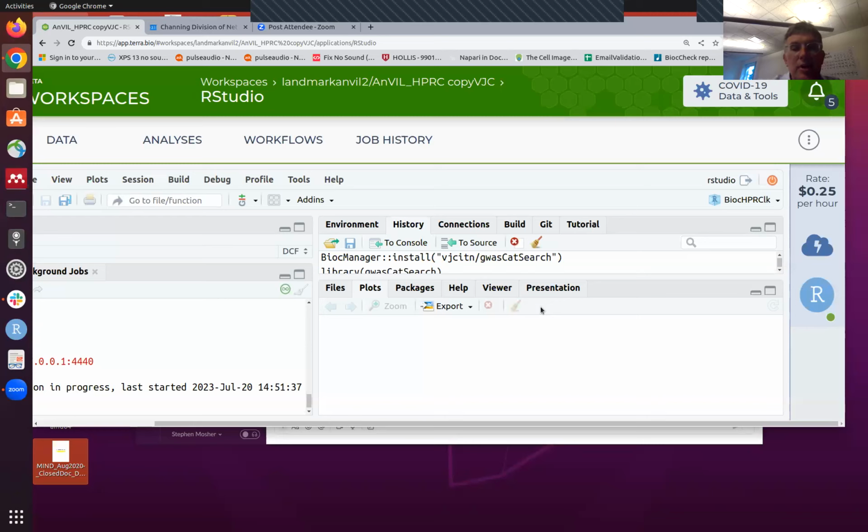And the examples are going to involve very improvised computations assisted by AnVIL and AnVIL assisted by Bioconductor. And I think there's always been a bit of vagueness about the relationship between Bioconductor and AnVIL, and I'm not going to be able to solve that here. I consider them to be quite symbiotic.